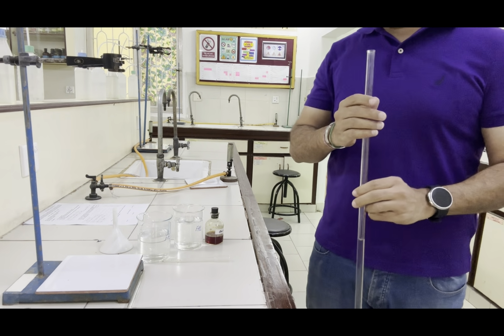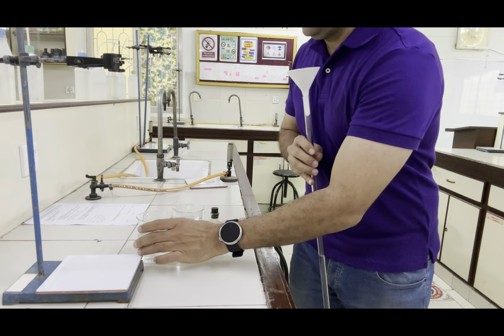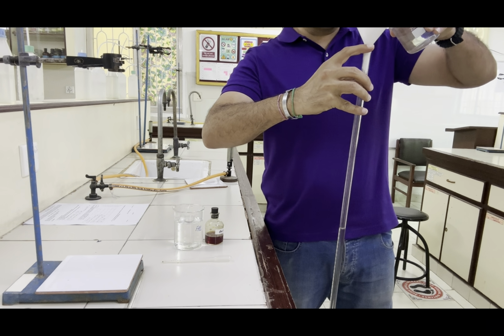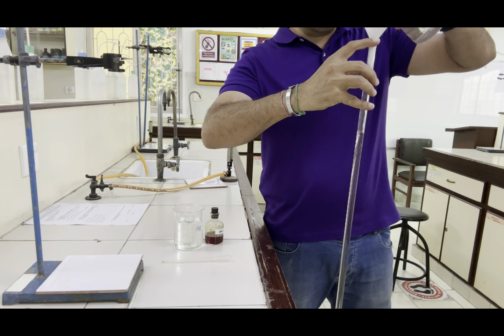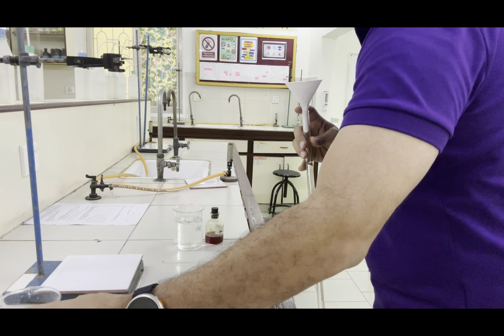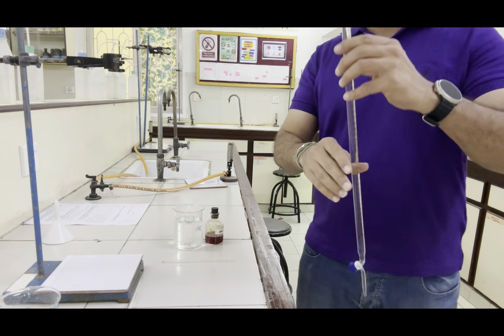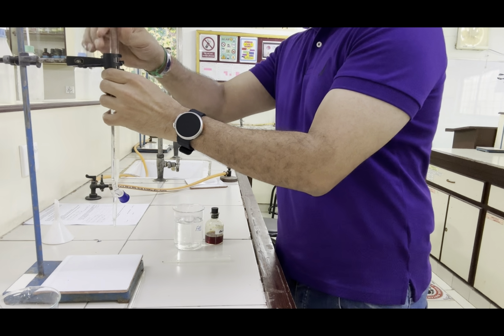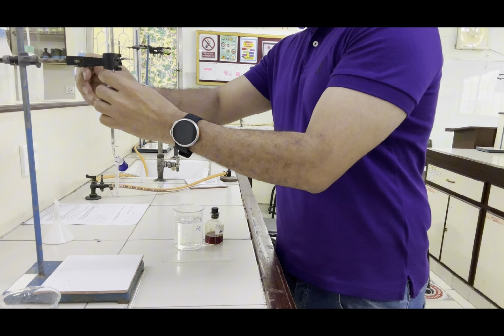So I need to put this funnel again and add Fa1 solution again, but this time I do not necessarily have to reach exactly 0. I can take any value that is lesser in number than 20. So in this case, I have taken the value near to 2. I will record the initial burette reading also.